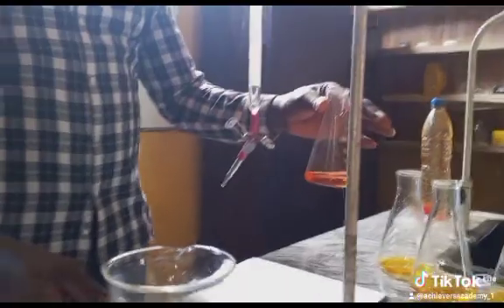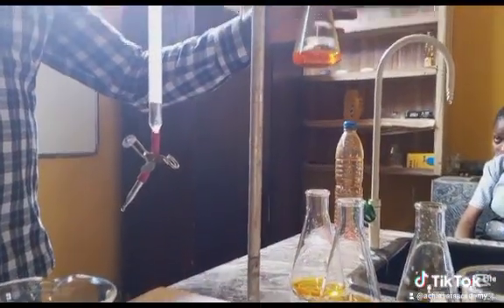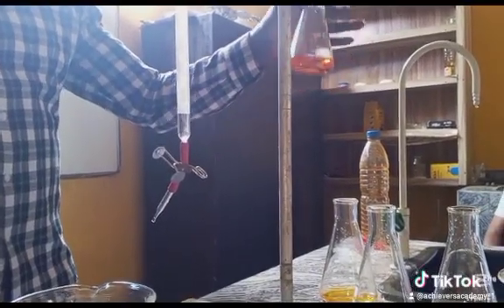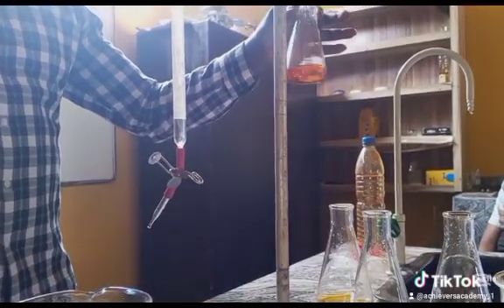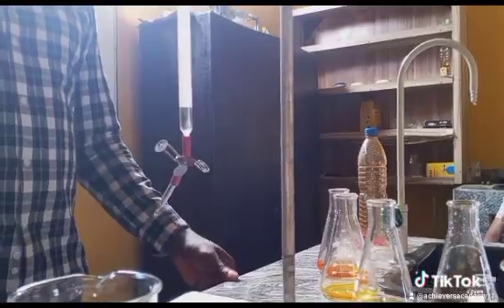Now that we have this color, compare it with this. What color is this now? Orange. Dark orange. This pink. Reddish orange. What color is this? Orange. Dark orange. Yes, reddish orange. Okay. Our interest is in the value.